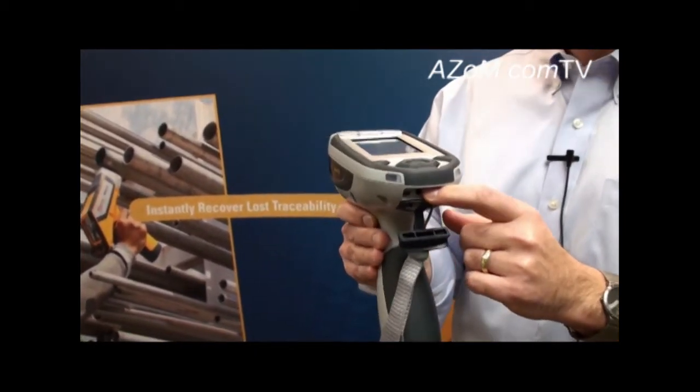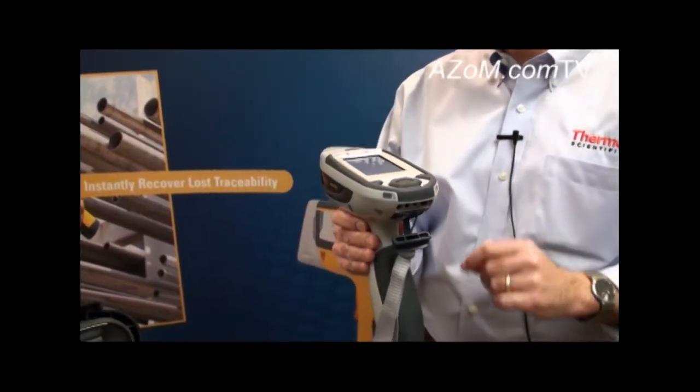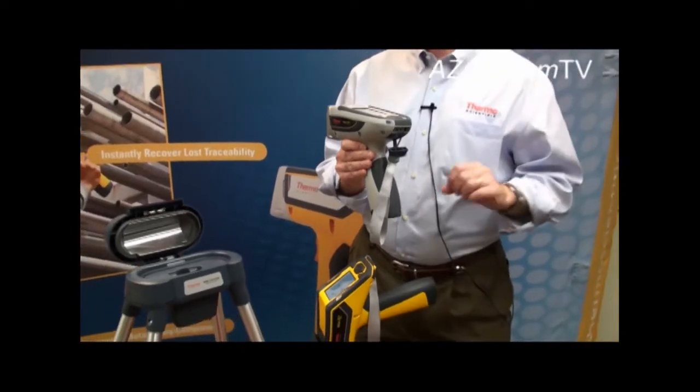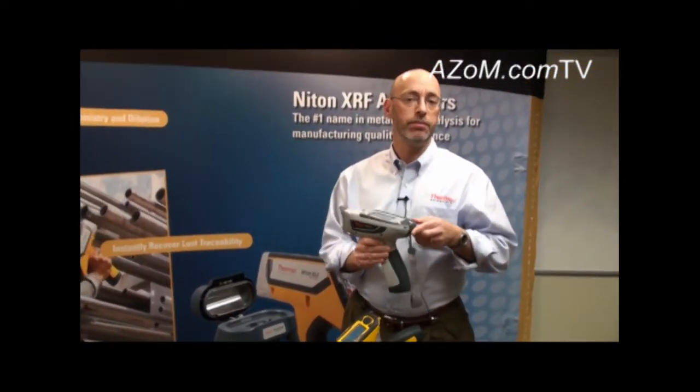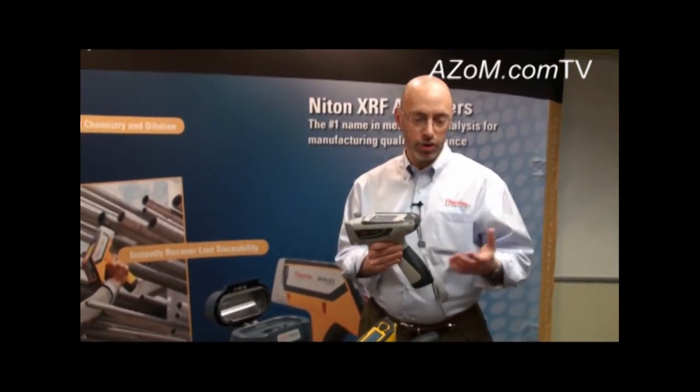What most customers really like is the built-in Bluetooth that comes on both the Niton XL3 and the Niton XL2. If you have a laptop or PC with built-in Bluetooth, it's just as simple as connecting via Bluetooth and downloading just about as quickly as you can on a USB cable.